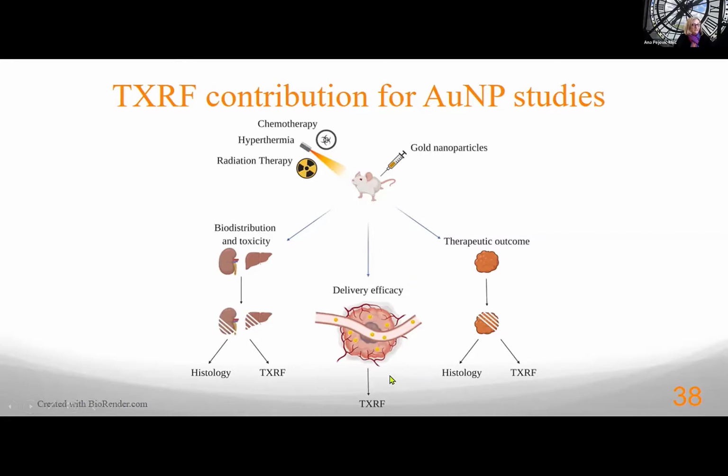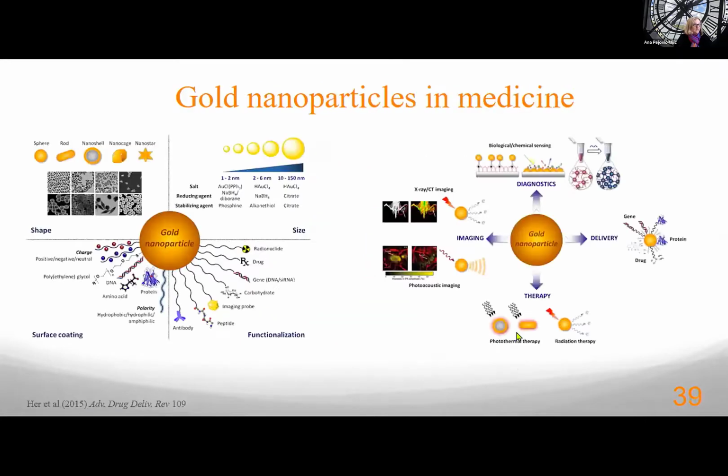We definitely can reliably measure gold nanoparticles in any of the blood compartments, being whole blood, plasma, or red blood cells. And we can also aid in looking into specific therapeutic outcomes based on the methods we developed. Now, although my research or my team is focusing on gold nanoparticles, their use is wide, and we can jump easily into diagnostics or any other need and use.